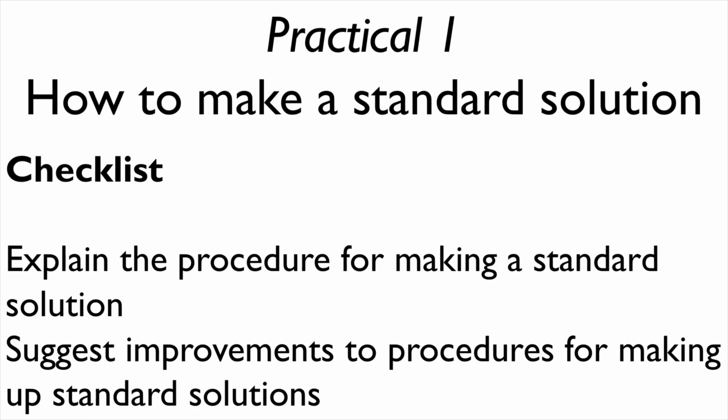By the end of this session we should be able to explain the procedure for making a standard solution, and you should be able to suggest improvements to procedures already given for making up standard solutions and how to spot errors. We're going to look at some exam questions from all the different exam boards as well, but we're going to first of all focus on the actual practical technique about how to make a standard solution.